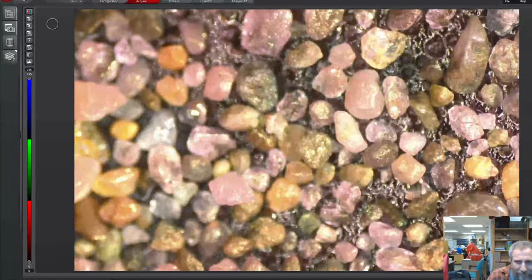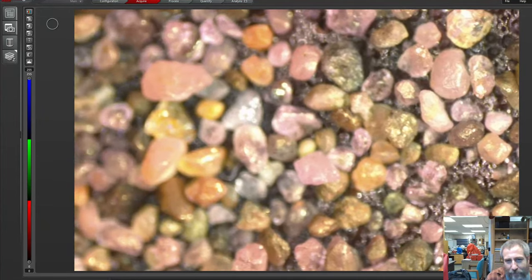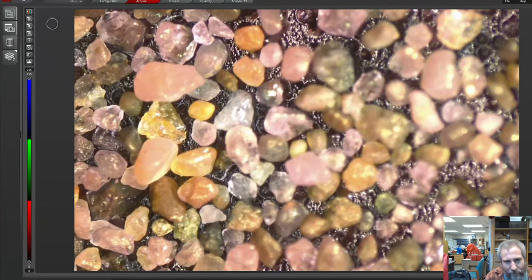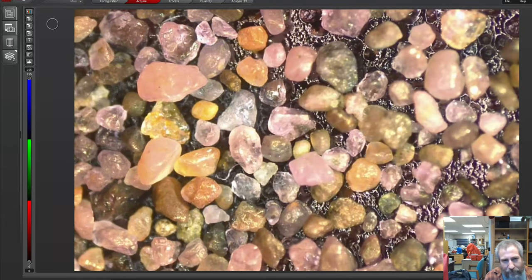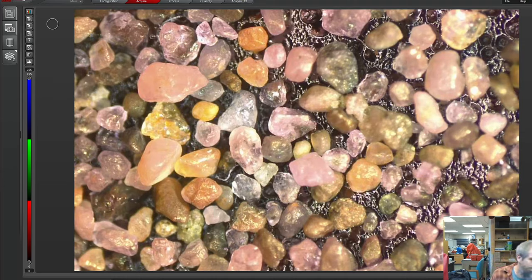There's some of the actual rocks. We can go back to looking at the geology a bit. These are some of the minerals from the beach. Some sand grains from the beach sample. Just sand. And these are gold plated, so it might actually be better if I got some of the original material and we could look at it without the gold plating on it. I still have it. I just didn't bring it over to this lab.